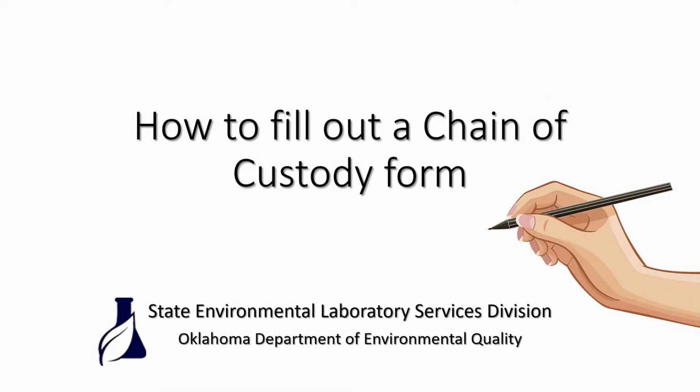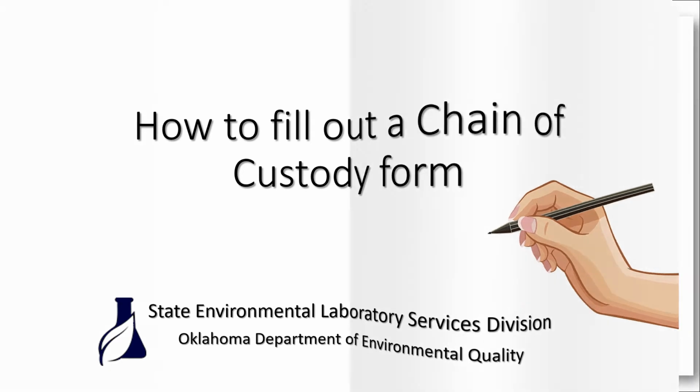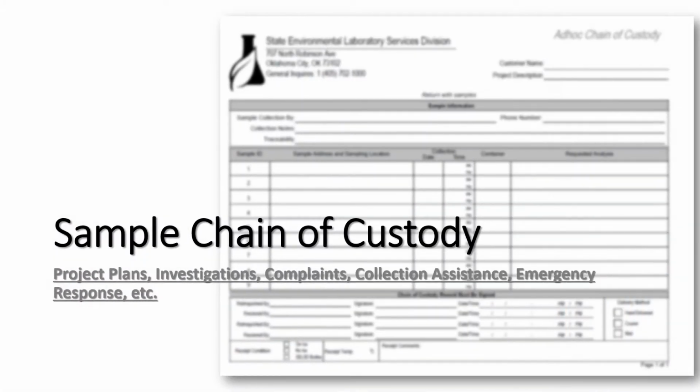Welcome to the training, How to Fill Out a Chain of Custody Form, brought to you by the State Environmental Laboratory Services Division. This training will describe how to complete a pre-log chain of custody and an ad hoc chain of custody. This chain of custody training is targeted to DEQ divisional staff.